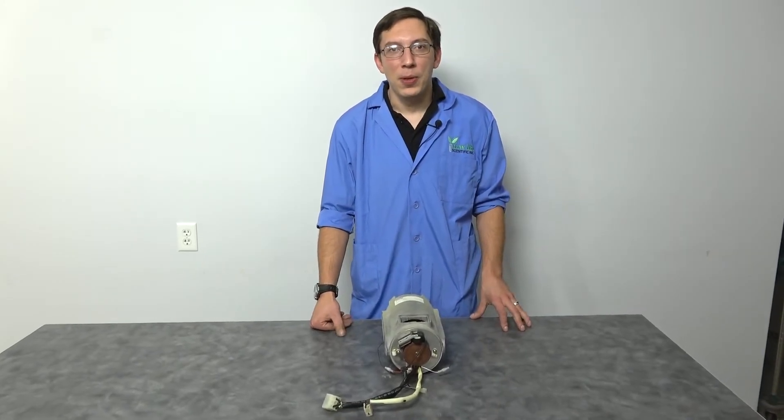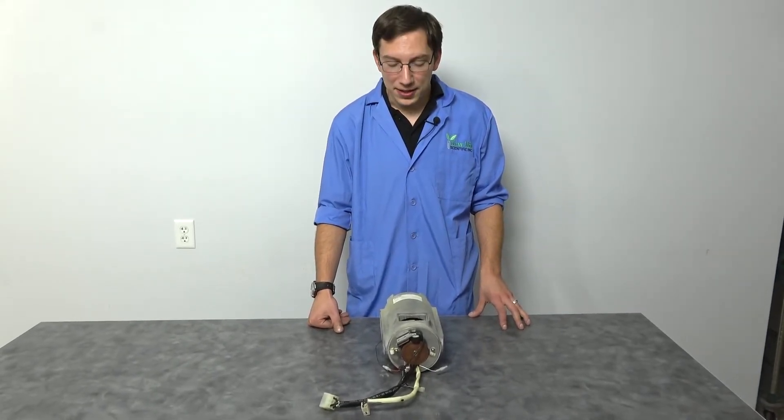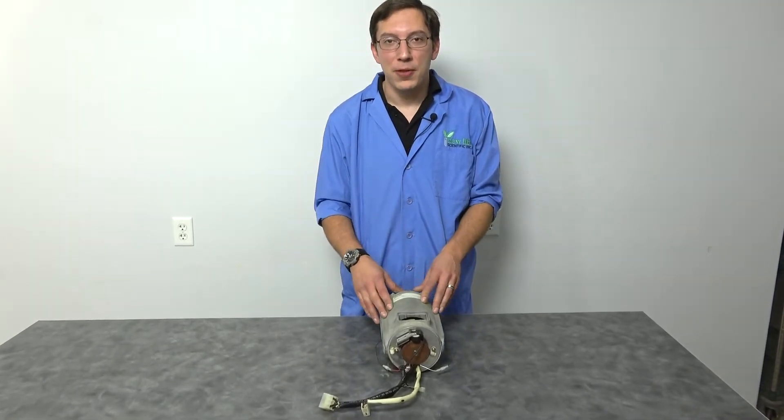Hi, my name is Bart. I'm here with New Life Scientific, and today we're going to show you how to change brushes on your centrifuge drive.